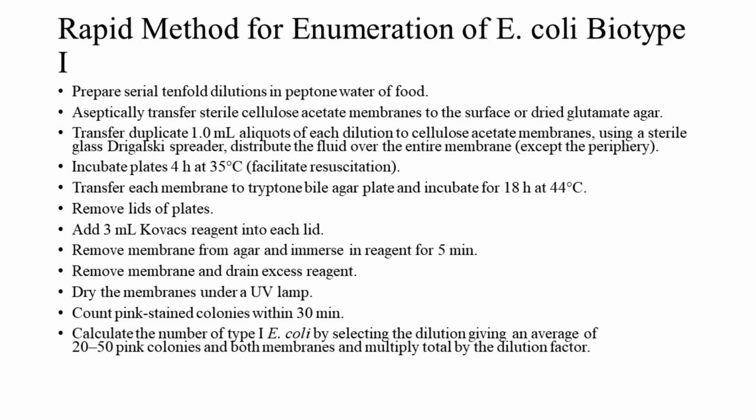Transfer duplicate 1 ml aliquots of each dilution to cellulose acetate membranes, using a sterile glass Drigalski spreader. Distribute the fluid over the entire membrane, except the periphery. Incubate plates for 4 hours at 35 degrees Celsius to facilitate resuscitation.